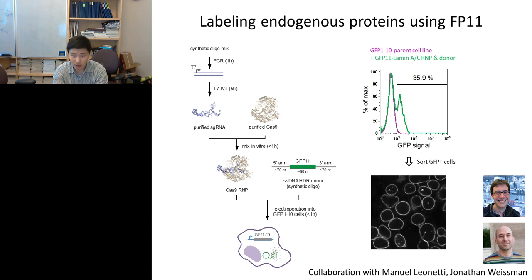Because our goal is to establish a method that we can really scale up to a large scale, I asked Manuel, Daiji, and Sayaka to pick their favorite target genes and try to make a mini library. So the three of them spent 3 weeks. 1 week to pick the target genes and design the sequences. 1 week to wait for IDT to synthesize the DNA and send us the oligonucleotides. And another week later, we have the cell lines.